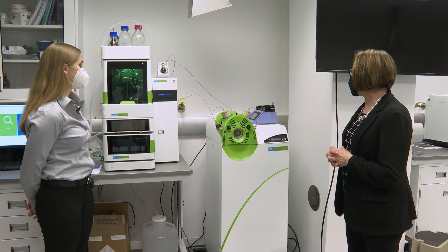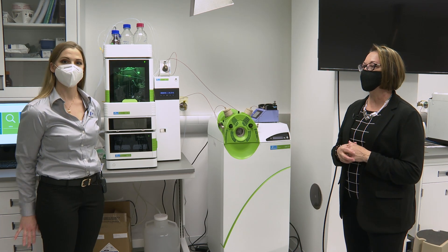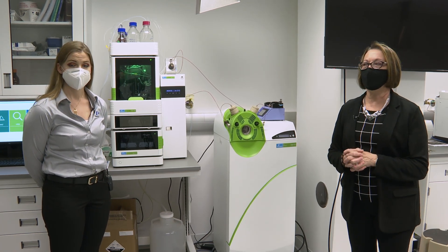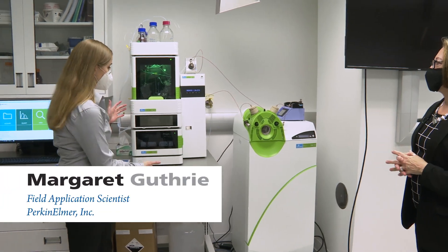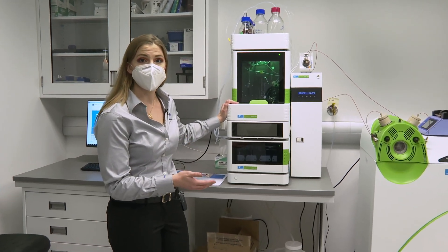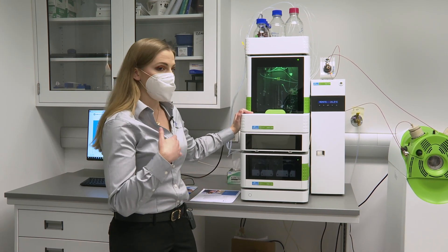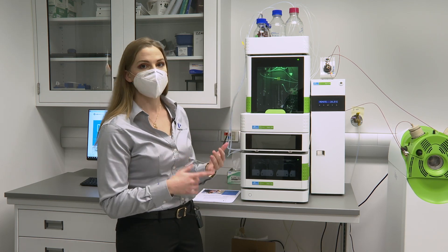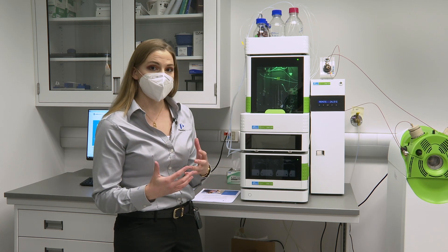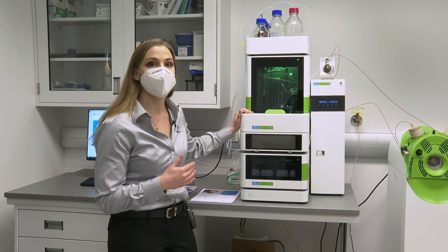Next, we're going to talk about our liquid chromatography — both the LC mass spec and the LC. I'm here with Margaret. This is the Q-Sight LC-MS triple quad. This instrument is used for low-level detection of contaminants in liquid samples — for example, contaminants from the production of clothing such as fire retardants or dyes. When you have nonstick coatings, you get things like PFAS or PFOS that accumulate in the environment, and we use this instrument to detect those things.